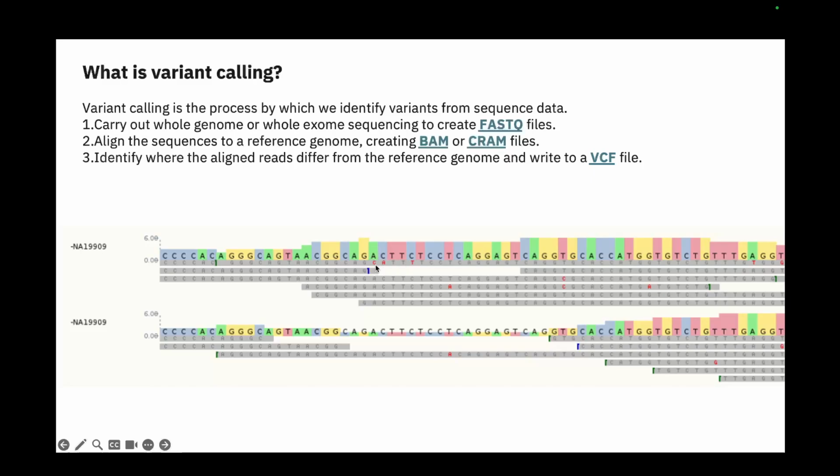But at this point, you have a conflicting nucleotide. In the reference there is an A, but in your read there is a C. But as you see, other reads supporting the same location have an A. During alignment you'll have multiple reads aligning to a similar position. So one position will be covered by multiple reads, as we discussed in coverage and sequencing depth. Each of those reads will tell you what the nucleotide is in that position.